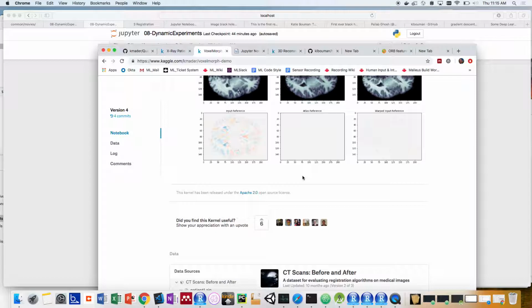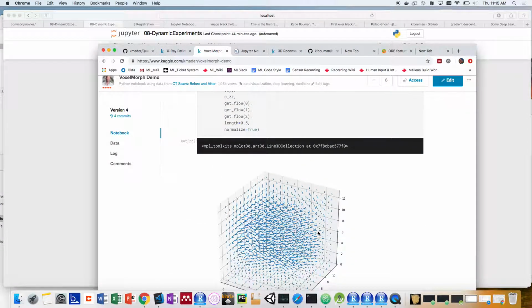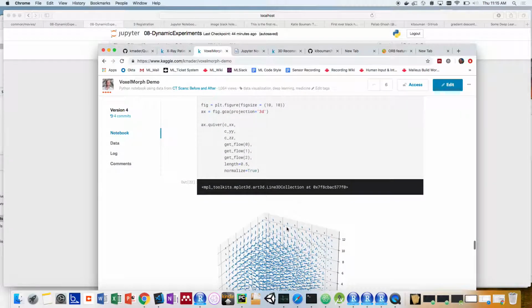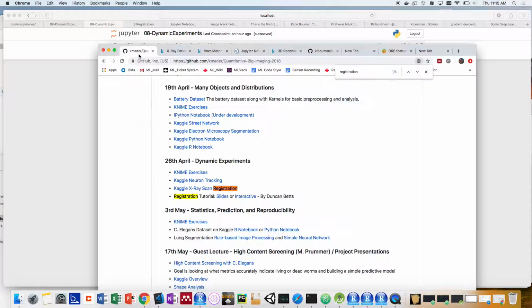It's a quite interesting technique where you can have not just the optimizer for your transform, but learn the actual transform itself, where at each point in the image, you predict how far it has to move in order for the moving image to map to the input image. It's also quite nice because once the model's trained, you can do this instantly. You don't have to perform iterations anymore. You can just perform one-shot analysis to do that. But I can add that to the slides.